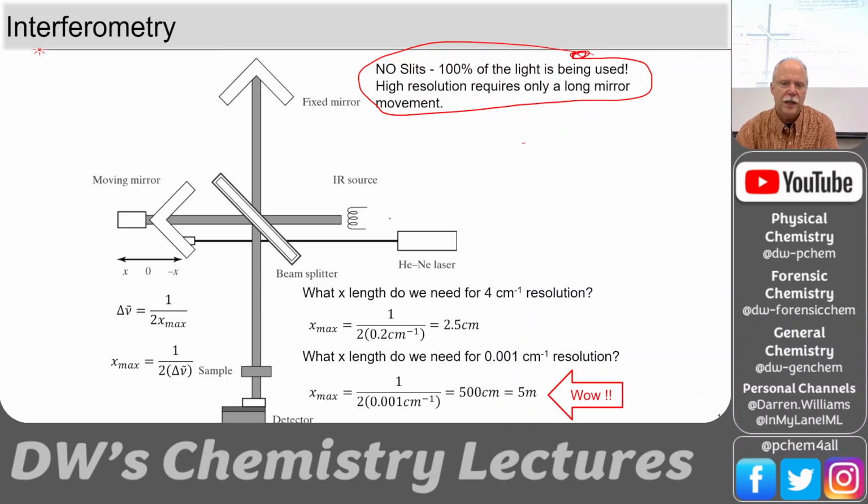So the light comes in, so we've got the infrared source, it's coming in here. It hits, let's see, yeah, okay. And so it's split 50-50. So 50% goes up and 50% goes through. So how do they do that? Well, they have a salt window, and they've perfected the process of sputtering a little bit of aluminum on there, or mylar, or some kind of metal that's going to reflect the light. They could make it a perfect mirror, and then 100% would reflect. So they just sputter a little bit, and they get 50-50.